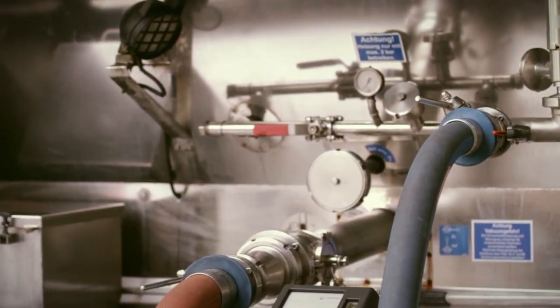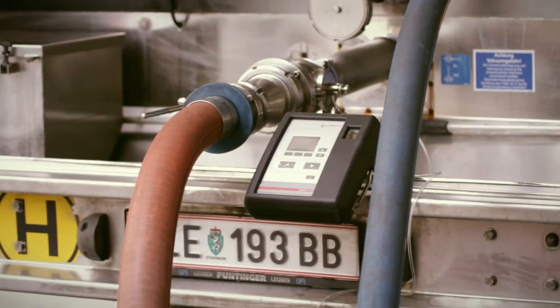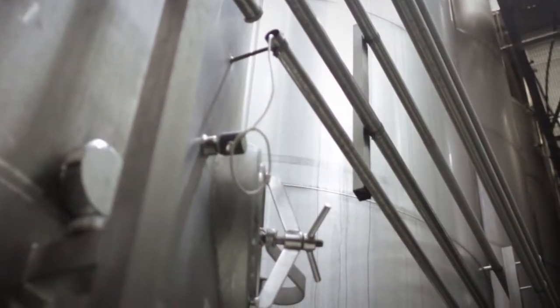Whether from tankers, tanks, or process lines, the determination of dissolved CO2 and O2 is a frequently performed task in beverage production.